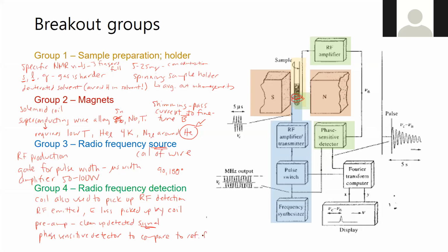But it's like a reference frequency that is used, and we compare our signal to that frequency, and what we register is the difference between these two signals. And this difference between the frequencies is digitized and stored. And there are multiple equations for that, which we're not going to go deep into.